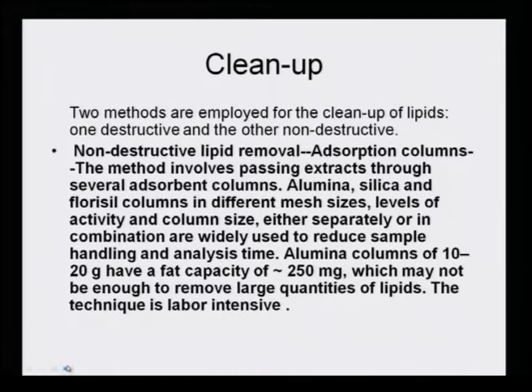The method involves passing extracts through several adsorbent columns made out of alumina, silica or Florisil in different mesh sizes, levels of activity and column size, either separately or in combination, and they are widely used to reduce sample handling and analysis time. Alumina columns of 10 to 20 gram have a fat capacity of 250 milligram, which may not be enough to remove large quantities of lipids.